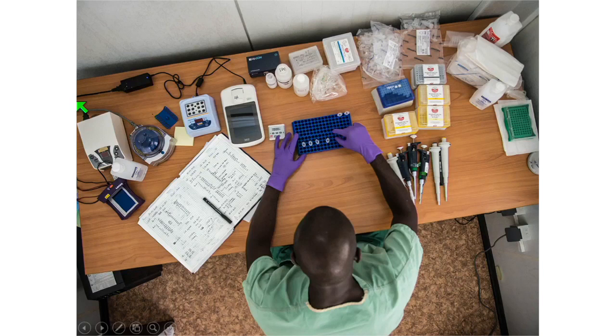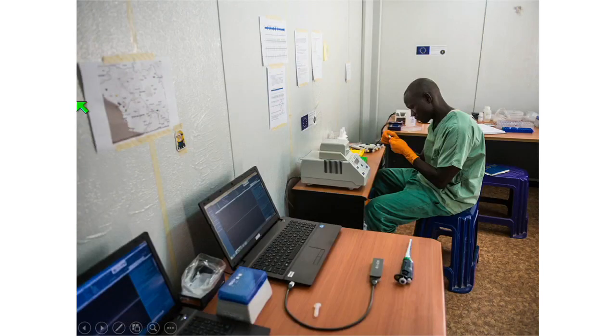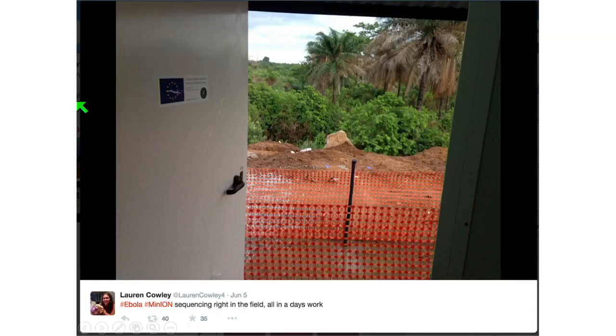And we've just got some arty shots of the setup here. This is Joseph, one of the local Guinean scientists who we trained up to use the Nanopore, and various volunteers went from the UK to provide this sequencing facility to the WHO. And you can see this is from Koya. This is genuinely sequencing in the field, okay?